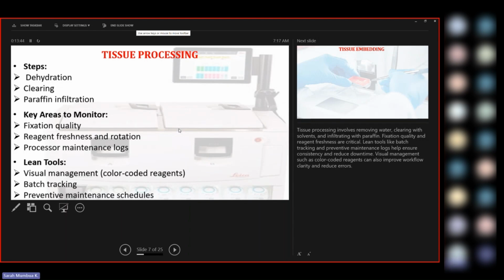So the next, after we are done with dehydration, we'll do clearing. Clearing is simply removing the alcohol now, because even the next steps here do not agree with alcohol. There are many clearing agents we learned in school, but in this case, what we'll use mostly is xylene. So clear using xylene, several changes. You can do 2 or 3 changes of xylene.